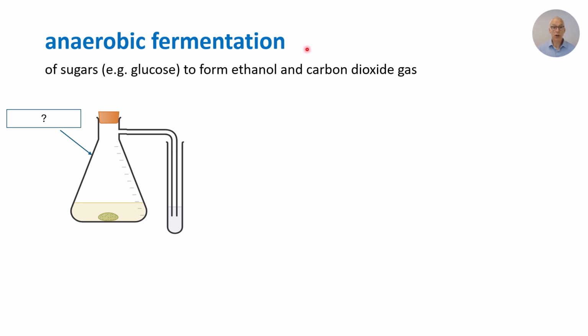Anaerobic fermentation of sugars to form ethanol and carbon dioxide. Again, here is the setup. Do you recall the conditions? What are the reactants? What do we mix in here? What sort of temperature do we use? Speak out an answer.